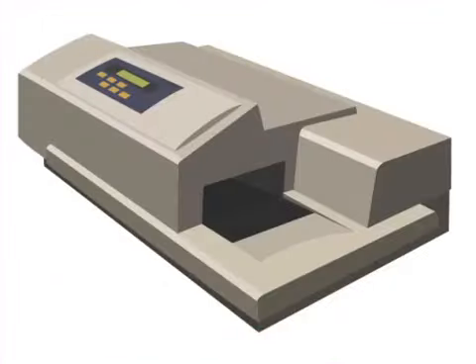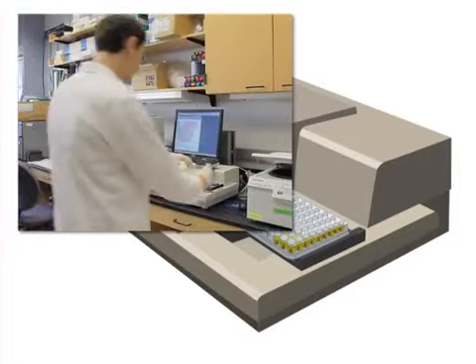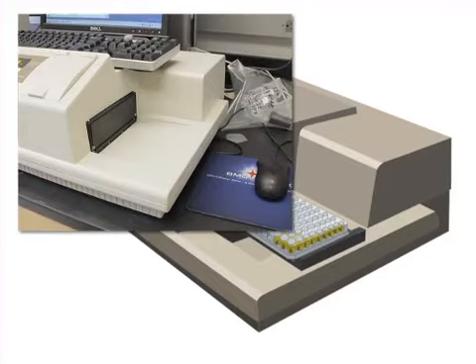A microplate reader will be used to quantify the concentration of the protein of interest in each well by reading the absorbance, that is, the amount of colored product in each well. The absorbance is proportional to the amount of target protein present.